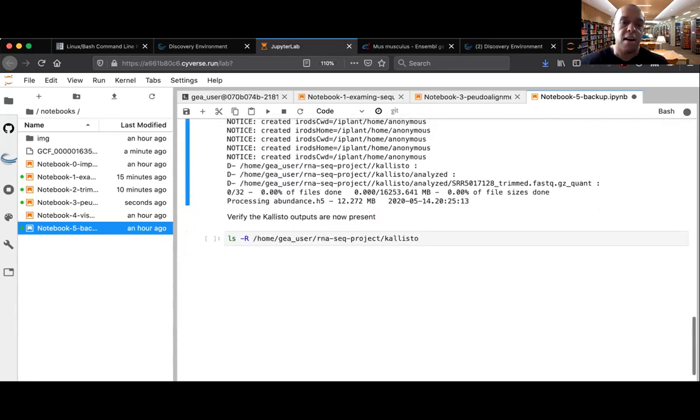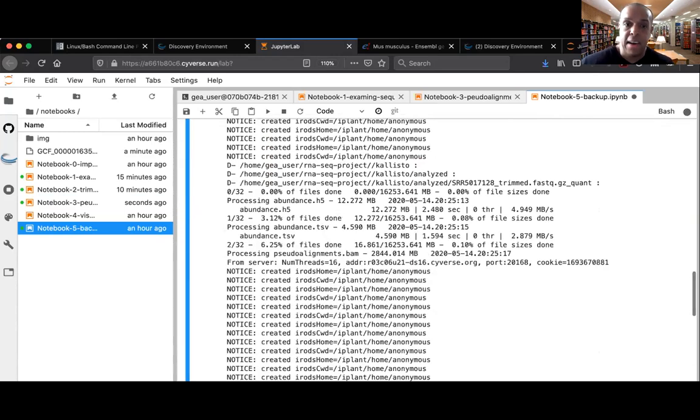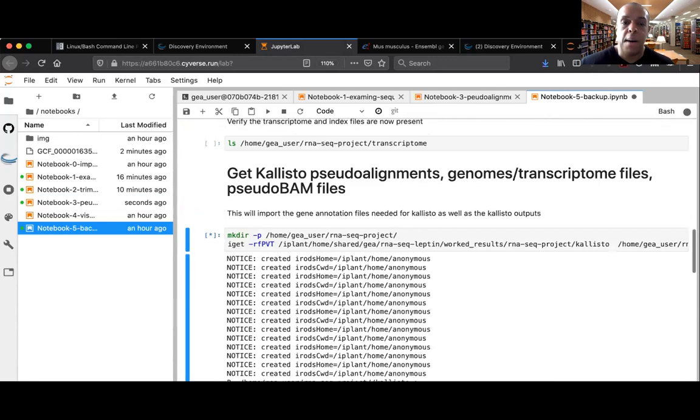I think there are a number of files, but what I want to do is give you at least a hint of what these types of files look like. And then once we take a peek at what they are, I'm going to show you how you visualize them. Remember, again, this series is just sort of an enrichment over the written lesson, which is very, very detailed. But if you're at that level where you're really starting to ask questions about how to use some of this stuff, we hope you explore it a little bit more.